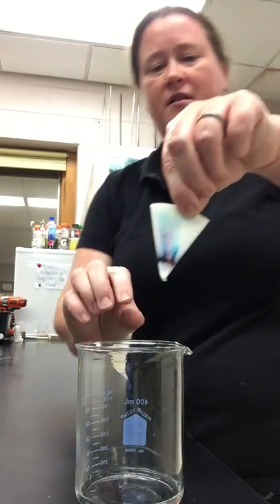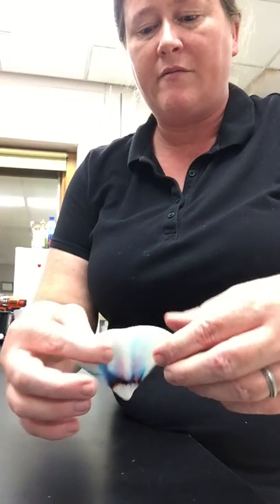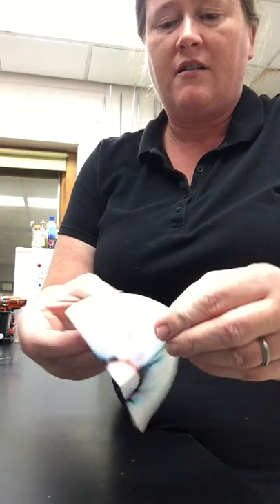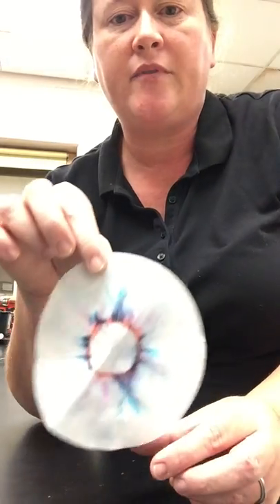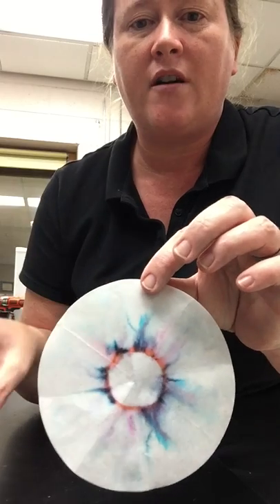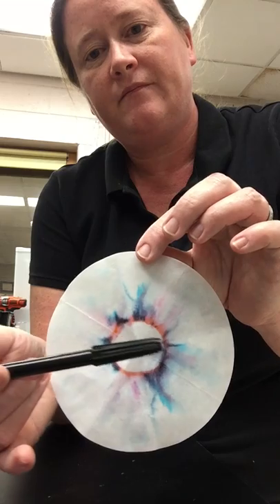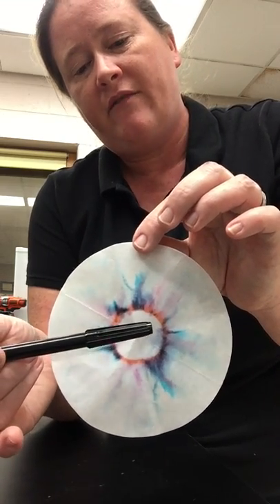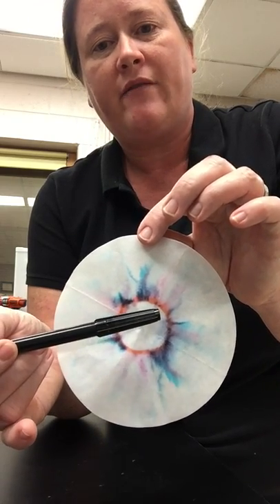Let us open this up and see the results of this chromatography. So what you can see here is that the blue dye really had the strongest affinity for the water, and it traveled the farthest with the water. In the middle you see some pinks and oranges — orange in particular — which have the least affinity for the water and more of an affinity for the paper, so it didn't travel quite as far.